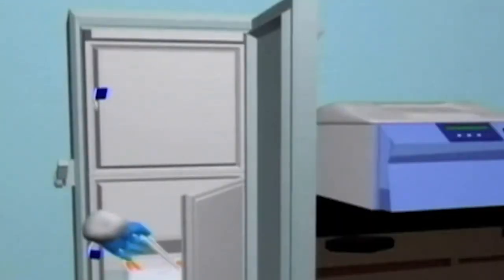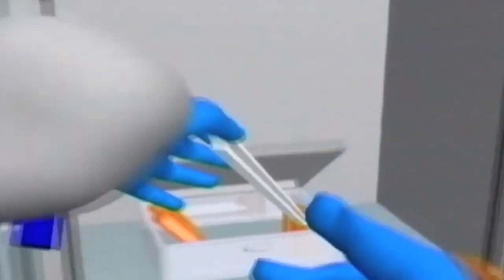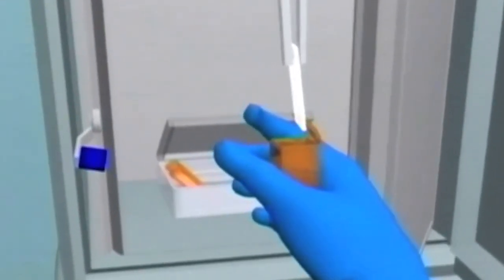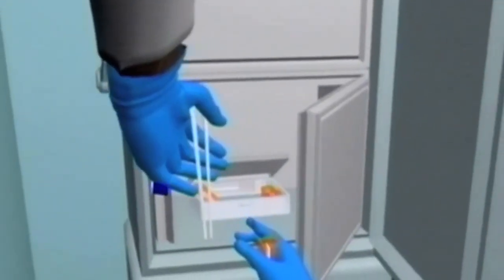So, there is only one difference between the cell-free expression based protein microarrays and the cell based protein expression microarrays. In the cell free expression one, you have to add the in vitro transcription and translation machinery to synthesize the protein, and then the whole assay can be performed on the chip. In the cell based protein microarray system, the purified proteins are printed on the chip and stored at minus 80 degrees, as you can see in the 3D animation.